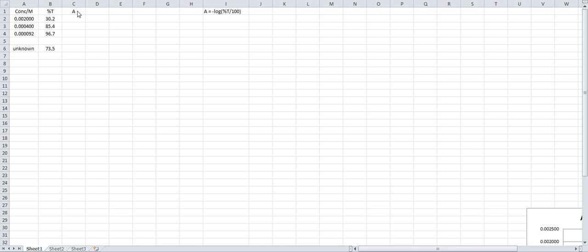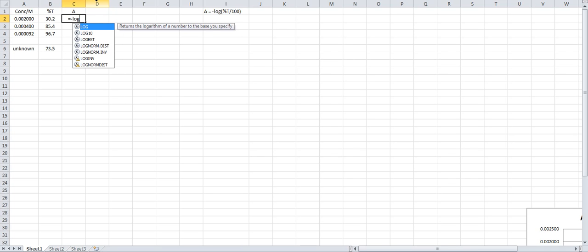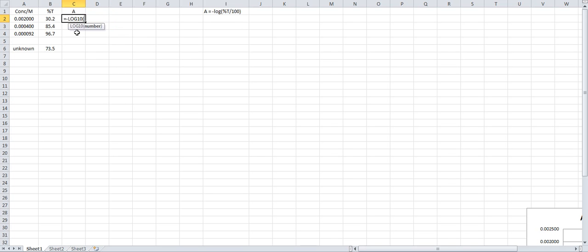Here we are going to calculate the absorbance or optical density using this equation I have in column I. What you'll do is left click in the box. You will type in equal, minus sign, LOG, and you want log base 10. You want the percent T, so that's B2.